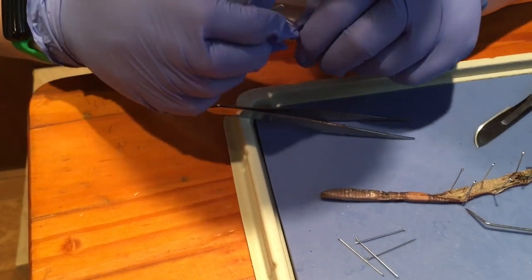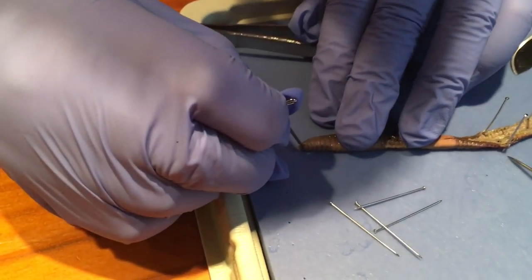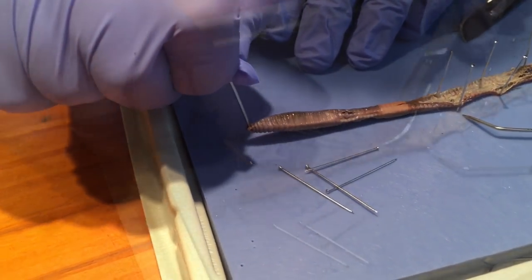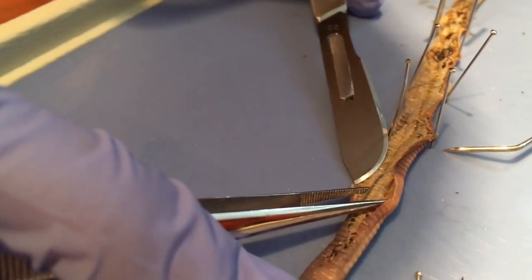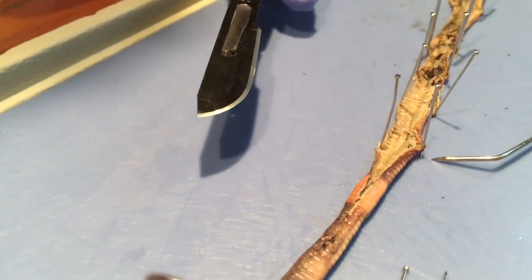Insert the pin right here at the mouth — not the anus. I think this may be the part where the eggs come from, right there. Is that where babies come from? Don't ask that question.